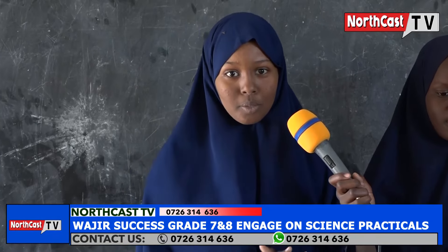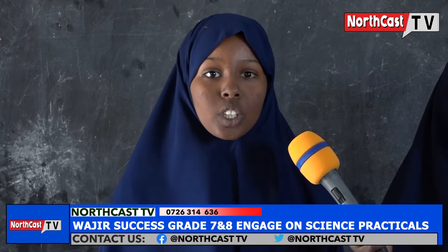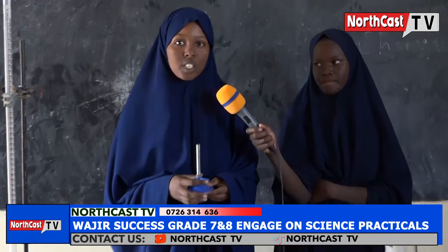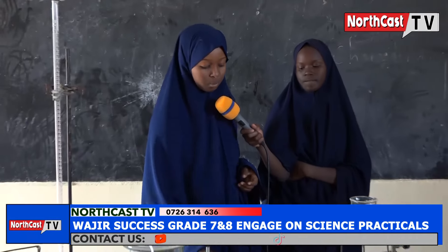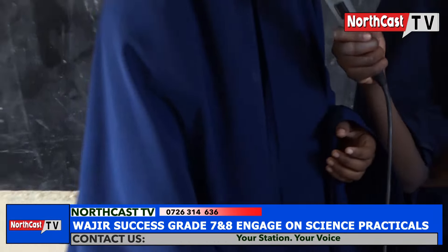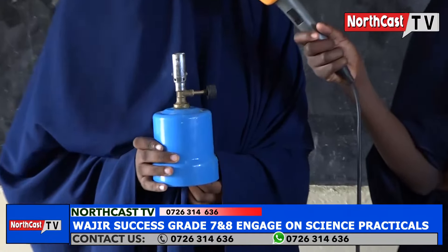I am a grade 7 student of OJIA Success Integrated Academy. I want to take you through apparatus used for heating purposes. This is a Bunsen burner. It is the most widely used source of heat in the laboratory. It is used for heating. This is a test tube holder. It is used to hold a test tube and boiling tube during heating. This is a portable burner. It is used for heating.